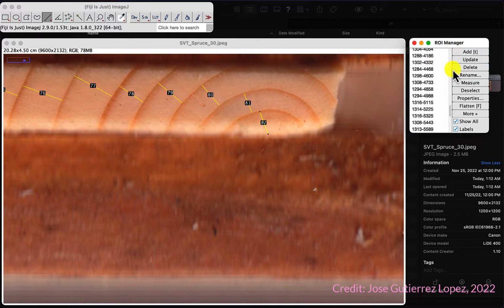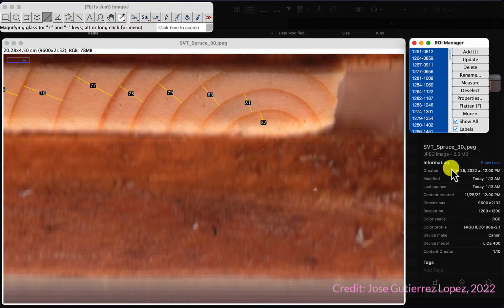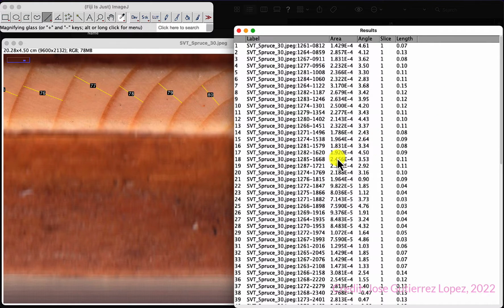Then we go to the region of interest. And then we just need to select them all. In my computer, I'm going to do Command A. And there are two options. We can go up to this menu. Sorry, that is not being recorded here, but it says Analyze, or we can just do it here also. On the menu up here, you would click Analyze and then Measure, which in my computer, there's also the Command M, or we can just click here on Measure.